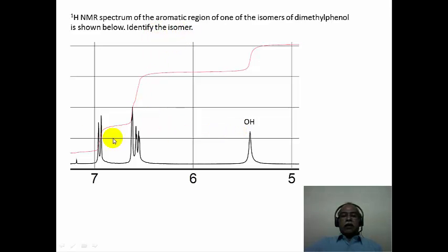Now if you look at it carefully, in the aromatic region between 6.5 to 7 ppm, there is a doublet with a large coupling which corresponds to the ortho kind of coupling. This corresponds to 1 hydrogen intensity. And then there is an unresolved multiplet with a very small coupling with a 1 hydrogen intensity, from this point to this point, the inflection point that you have here.